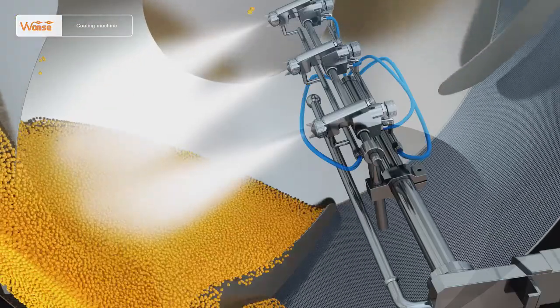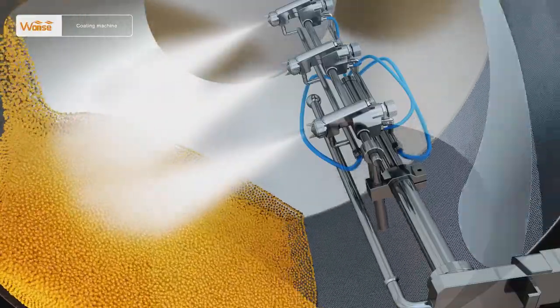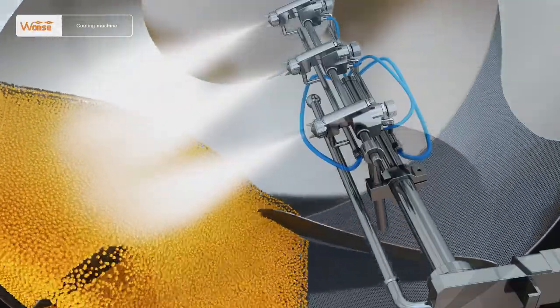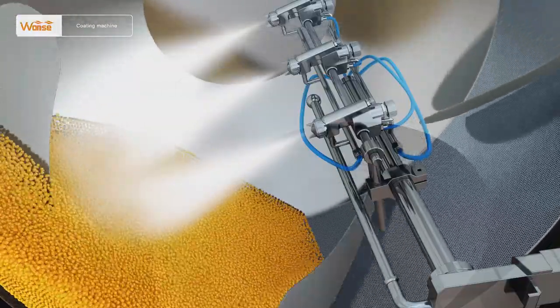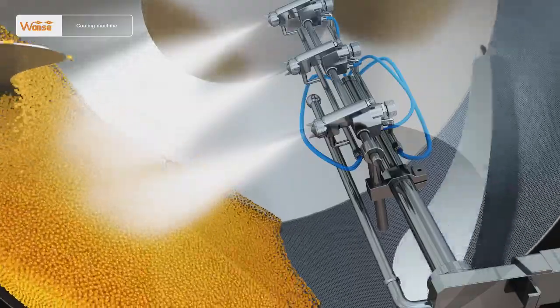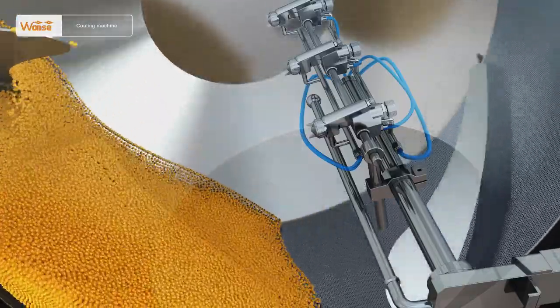Sixth, when the coating liquids are almost used up, observe if the surfaces of tablets or pills are even. Stop spraying when the surfaces become fine. Seventh, first stop the spray gun.